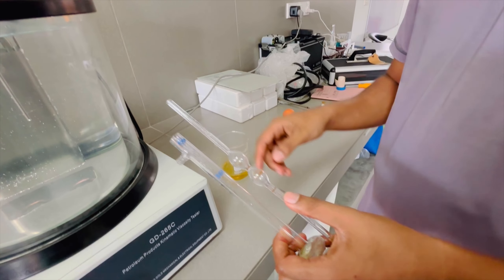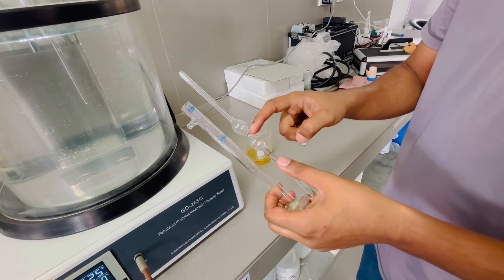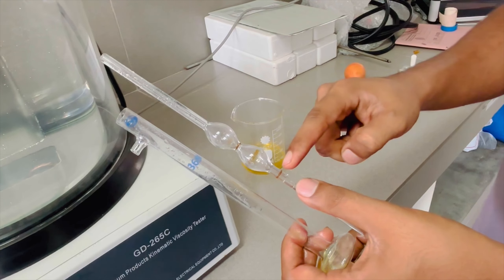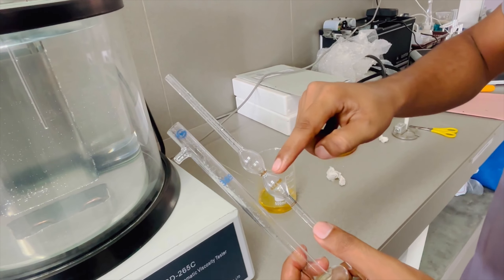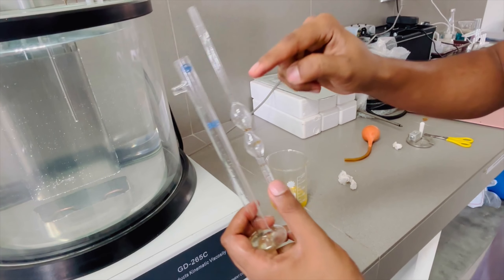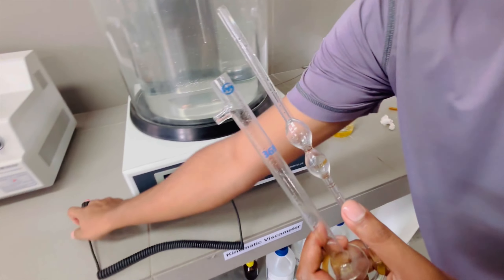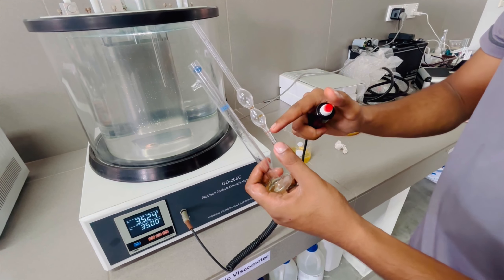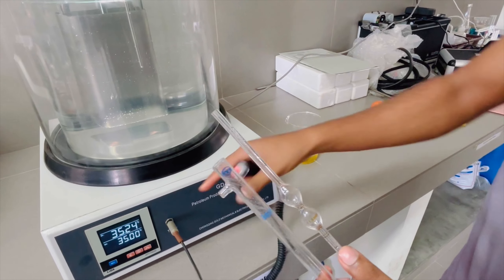I will add a little bit of oil. When I add the oil, I will add a little bit of oil in the oil. Then you can dip it in the oil level and press the time.